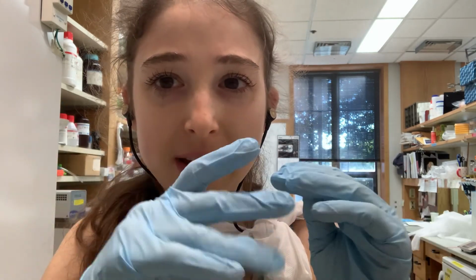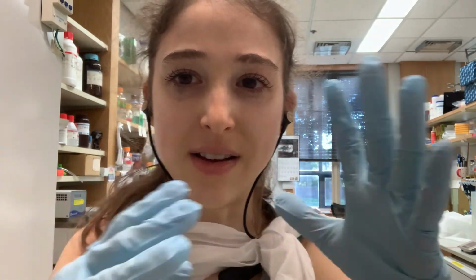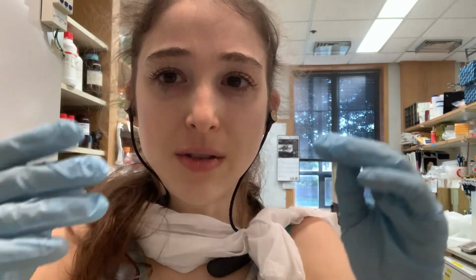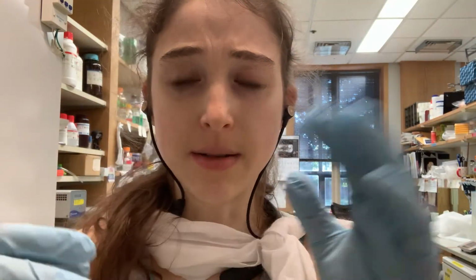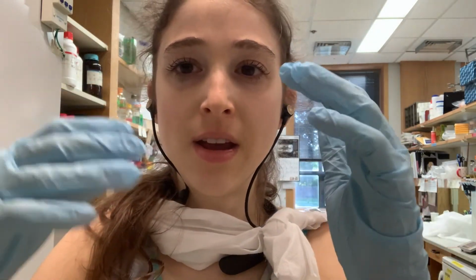Often you do a change to an alanine because it's the most generic thing to stick in there to see if that residue is important, but that may not always be the best change, and we'll talk a little more about that if I don't forget. But basically using these techniques I'm going to talk about, mainly SLIC and QuikChange, though there are other methods as well, you can make these changes to the DNA and then you have a new protein construct.